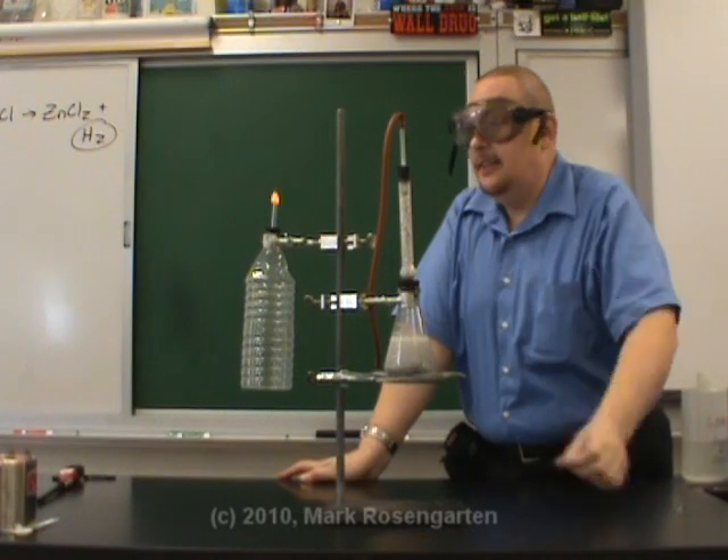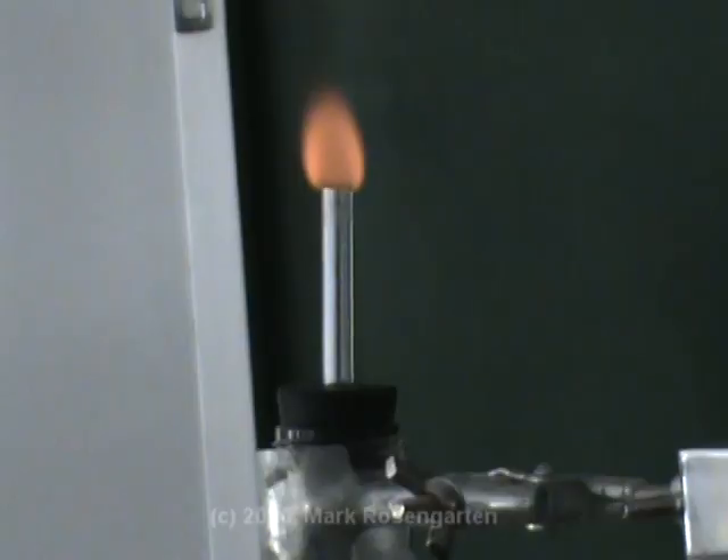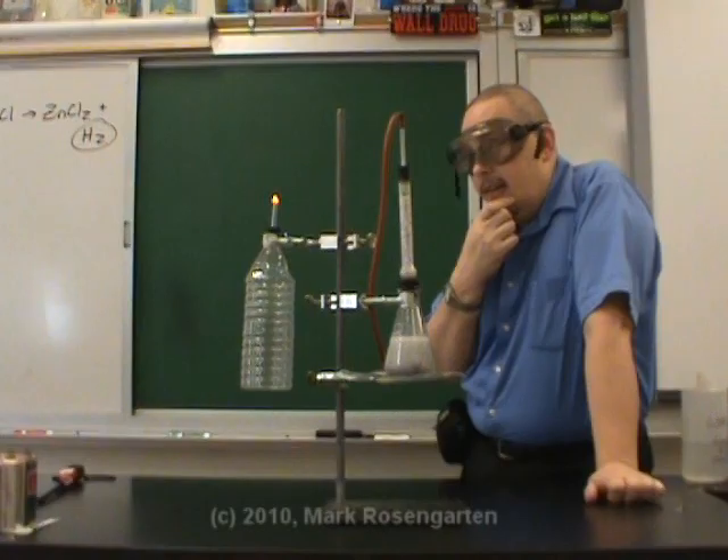All we're getting is a little flame — I thought hydrogen was explosive. That's the right color for hydrogen when it burns. This thing is supposed to be explosive. Why am I just getting like a candle? That's bizarre.